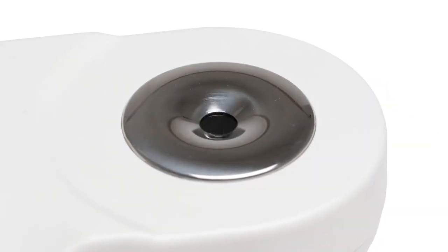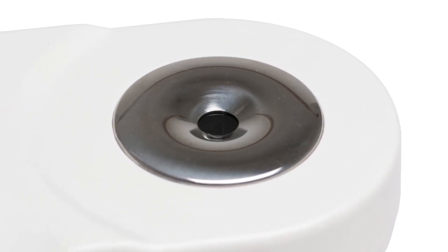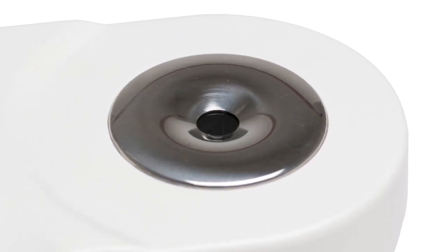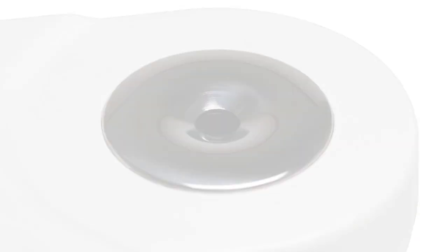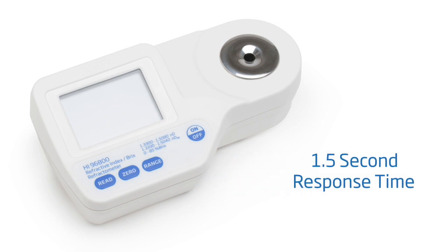The sample well is made with a stainless steel ring and flint glass prism through which a yellow LED is transmitted into the sample and refracted to a linear image sensor. The response time for taking a measurement is about 1.5 seconds.